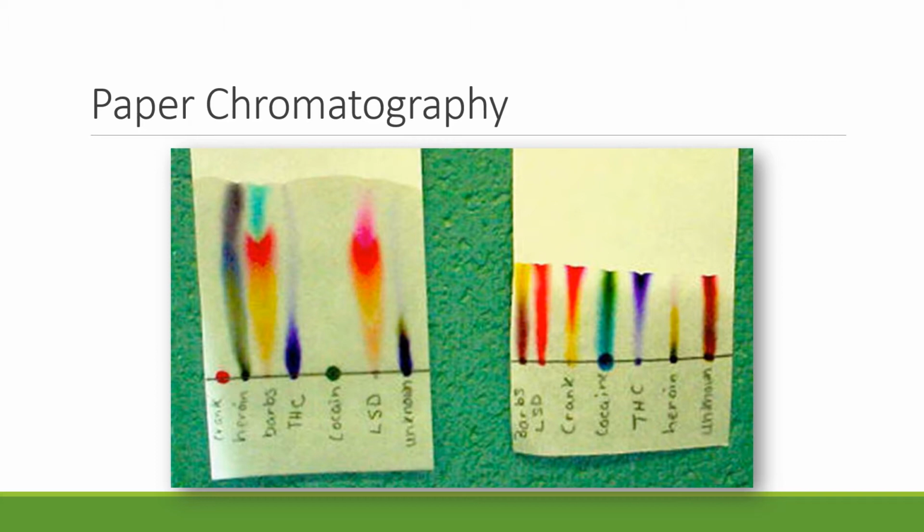And so then the capillary action will make the solvent travel up the paper, where it meets the dissolved ink. And so for paper chromatography, our mobile phase is that dissolved ink that slowly travels up the paper, and our stationary phase is the paper itself, which is going to separate out the different colors or the different components of the ink.